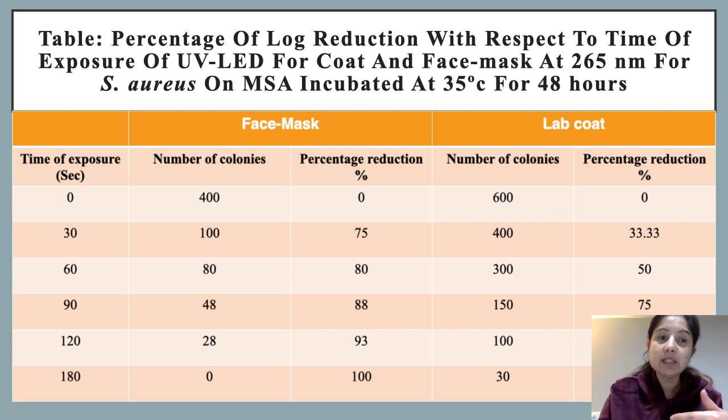And with the increasing time of exposure with UV LED at 265 nanometers, the number of colonies decreased. And at 180 seconds, we can see 100% reduction in colony count for the face mask, and 95% for the lab coat.